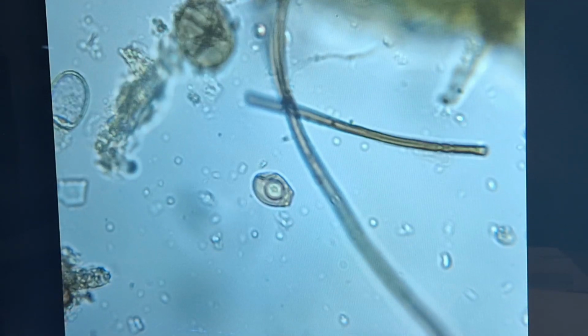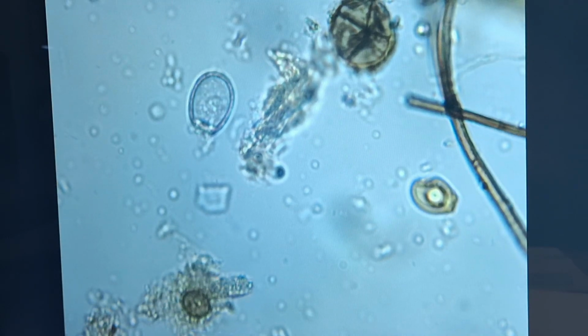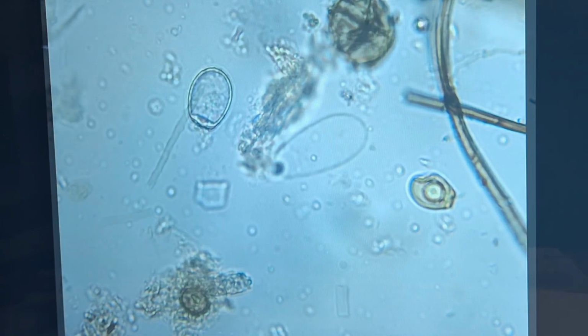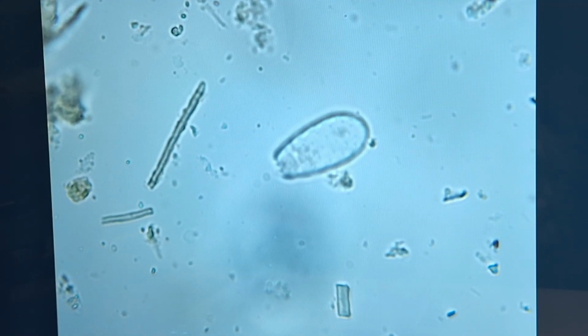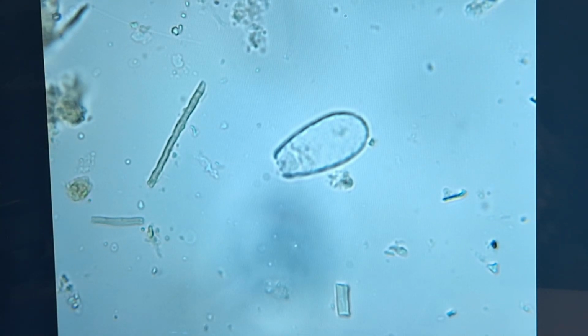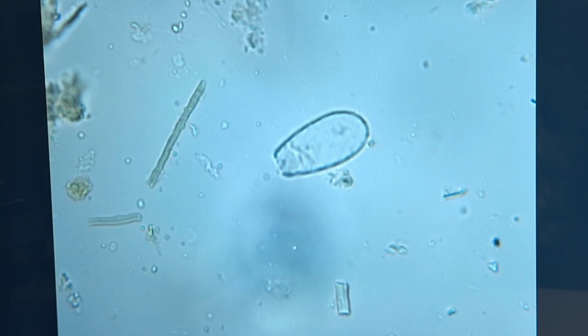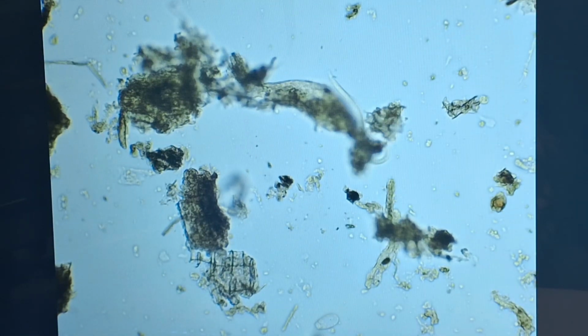Is that other one right there we look at, or another one? Let's wander. We've seen the flagellate. We didn't make it out very well. We've seen lots of these bacteria around us, lots of fungi. And I know there's a nematode just up. So now we're going to move up to the nematode next. The next layer up. There he is there.